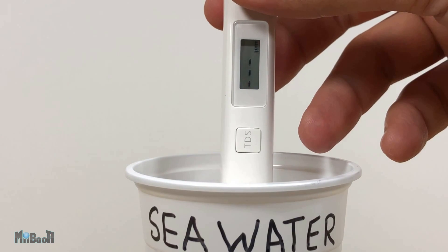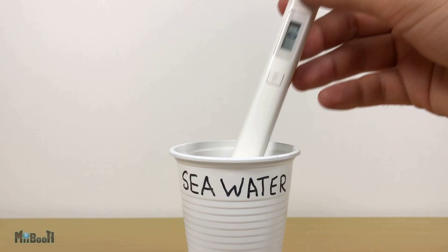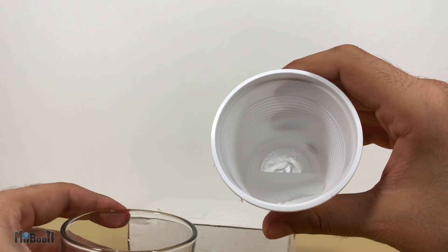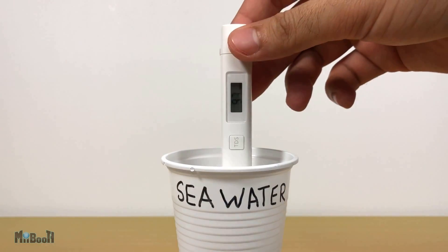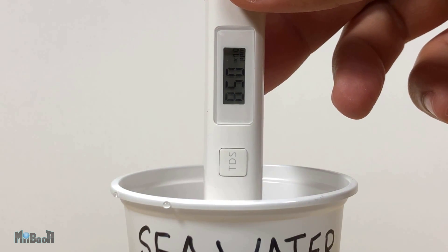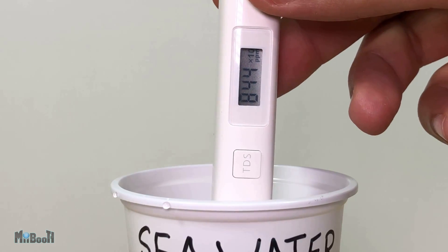This device can measure from 0 to 9,999 ppm, but the TDS of seawater is much, much higher. According to my research it has a ppm of about 35,000 — that means it roughly has 35 grams of salt per liter. I'm going to try diluting it with five parts bottled water and one part seawater. Even after all that diluting, it still shows 846 with an ×10 multiplier, meaning a TDS of 8,460 — still about eight times more than the recommended maximum drinkable limit.